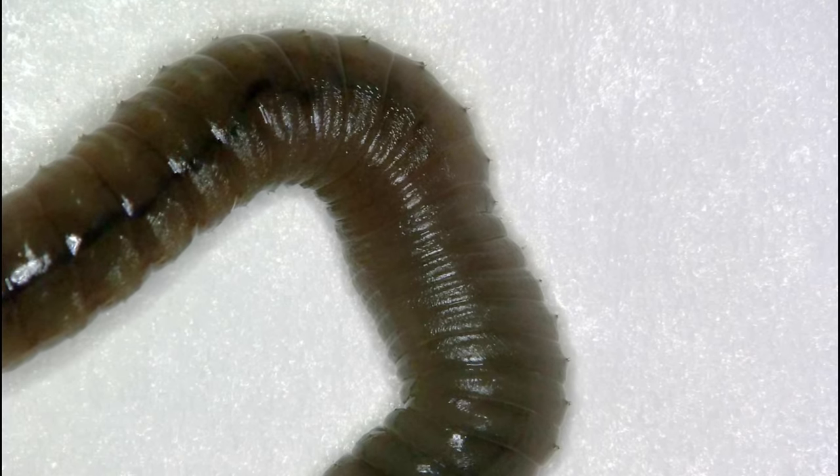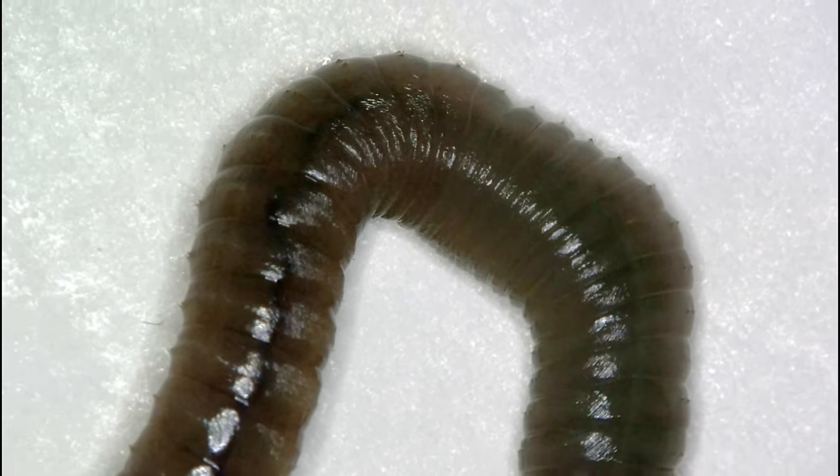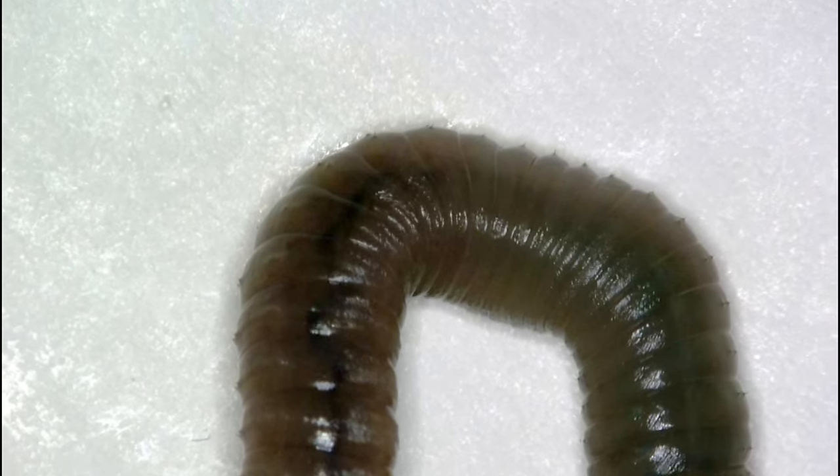Have you ever thought about how an earthworm works itself forward through the earth? Have a look here on this side, or maybe here on a little close-up. Do you see these little setae? These are small little hairs sticking out of the side of the earthworm, which allows it to grab the soil around it and push itself through it.